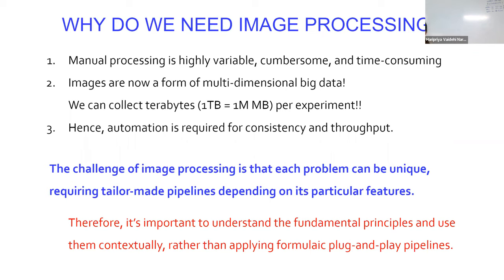I can't really give you the same for image processing. There's no such thing as you put it in here, you do these five steps, and you're going to poop out a result that makes sense. The challenge with image processing, the reason why it's even still such a hot research topic, is because every problem is a snowflake in some sense, and you've got to understand and love your snowflake and appreciate its beauty and its shape and everything. And once you have the shape of your problem, understanding what your problem's specific challenges are, then you'll be able to apply the right techniques to solve your problem.